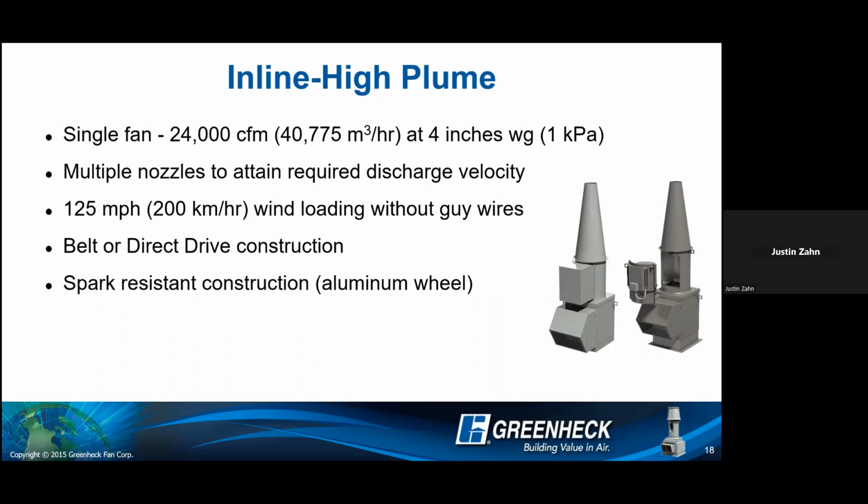And with that, sometimes people think that these motors sit within the airstream. In this particular case, they're not 100% wrong, but still, these motors will never come in contact with that airstream because they actually sit within an isolated housing within that fan. The reason behind that is we don't want anyone coming in contact with whatever is being exhausted, or any parts of that motor coming in contact with whatever is being exhausted out there.